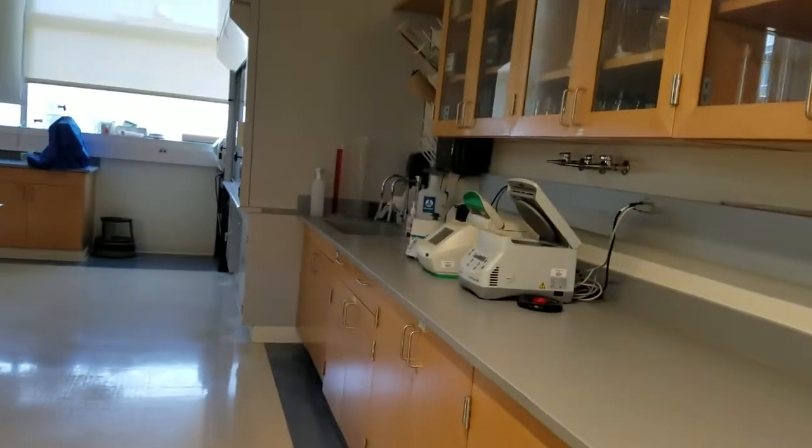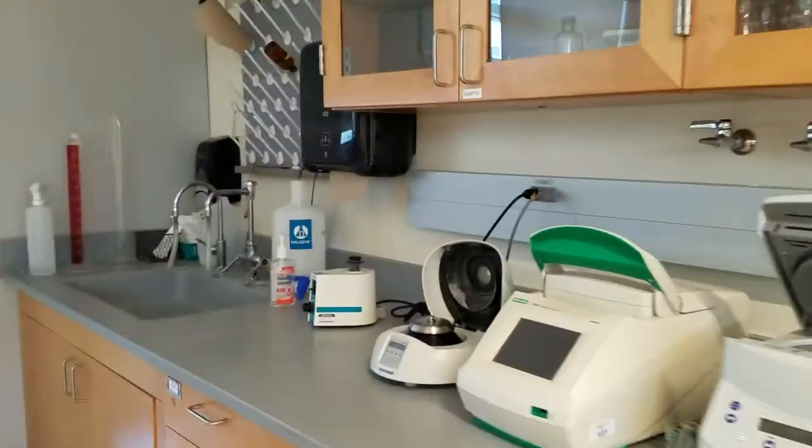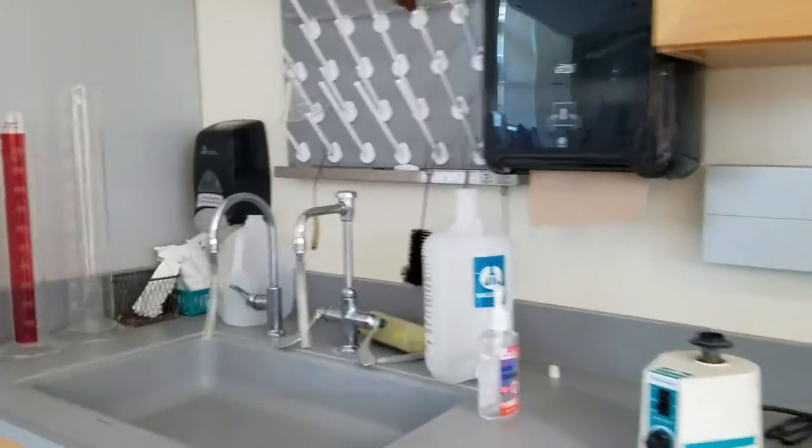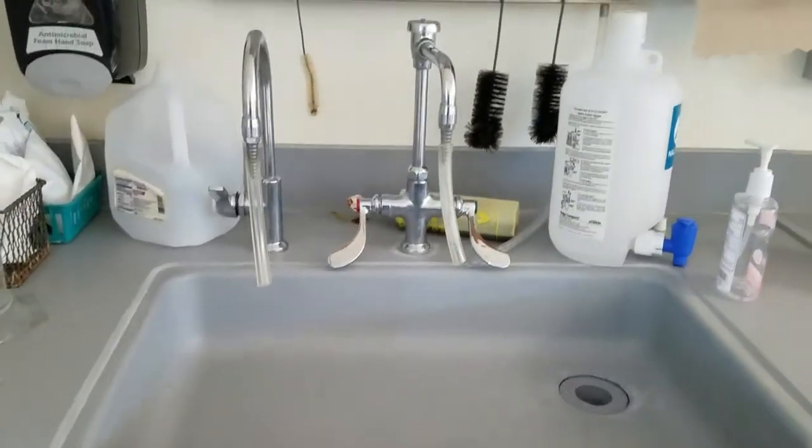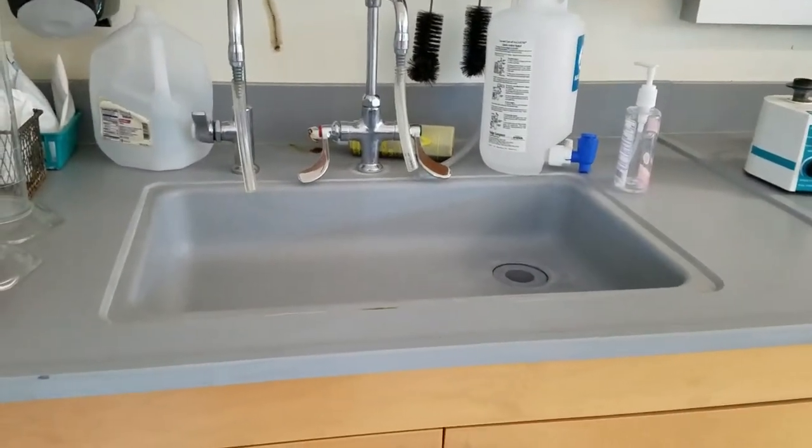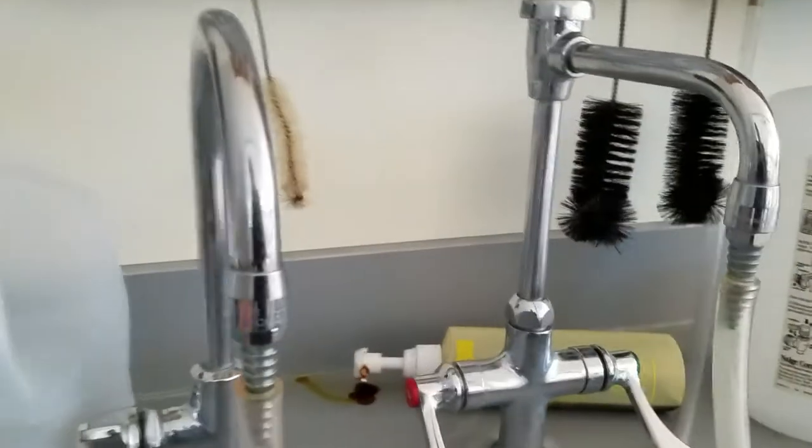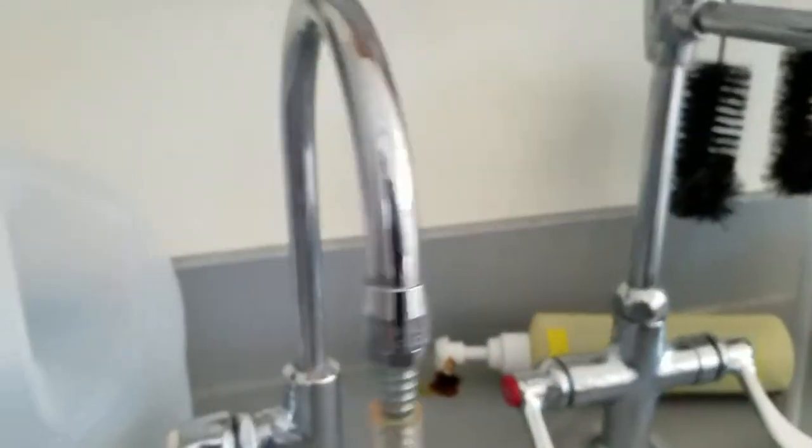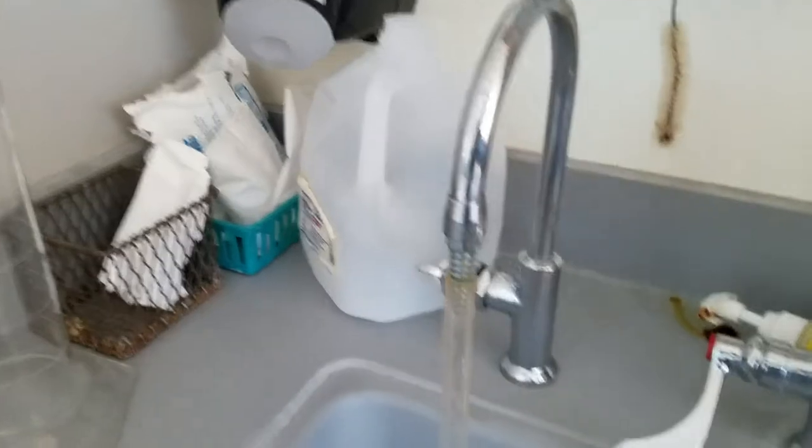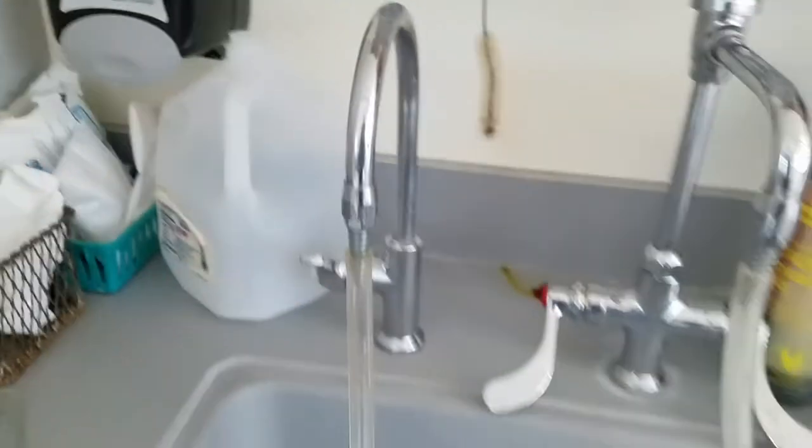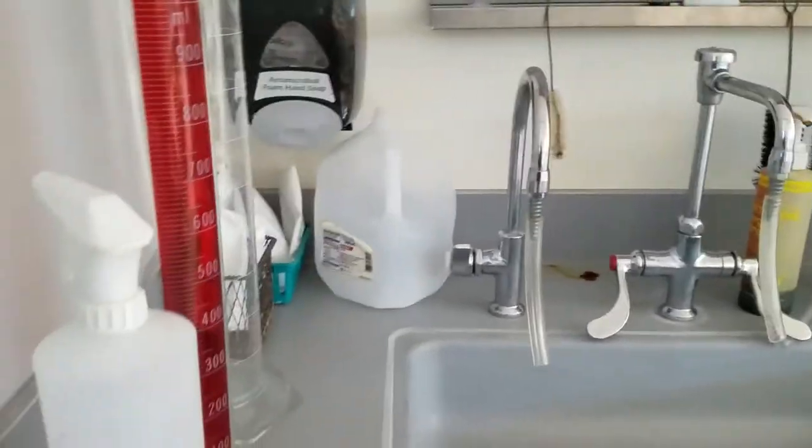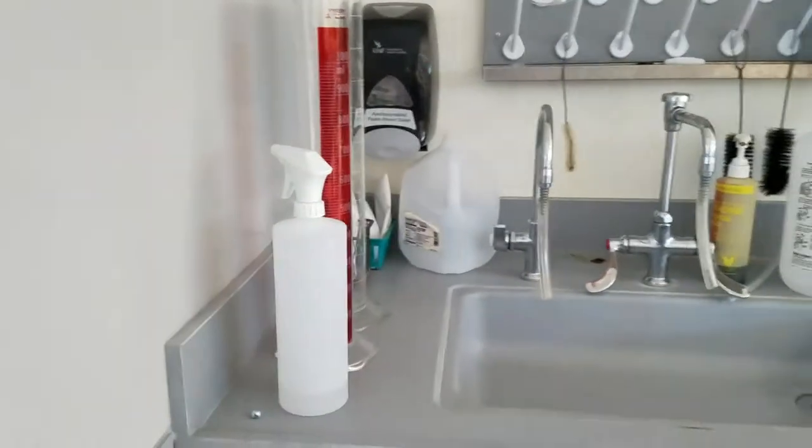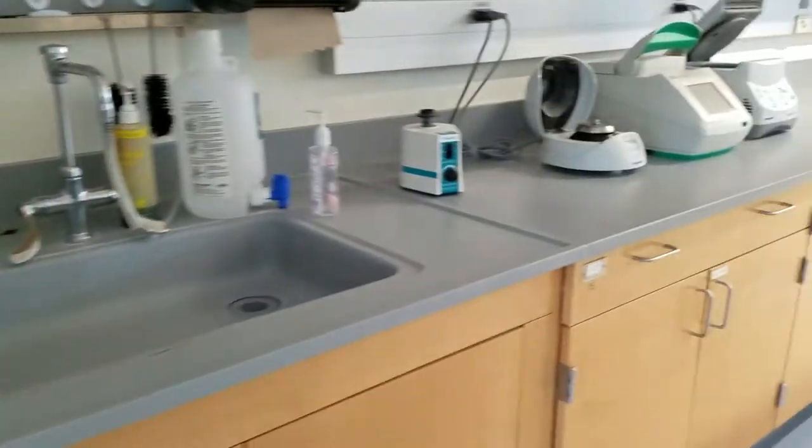Here's another sink back here. This one is a shallow sink, so I don't recommend you wash your dishes in here because it tends to splatter a lot. But this one is important because this has the RO water, so this one is what we use for deionized water anytime we need clean water to use for our experiments. Also this is where I make all my dilutions of buffers because that's where I can get that water readily available, easy to use.